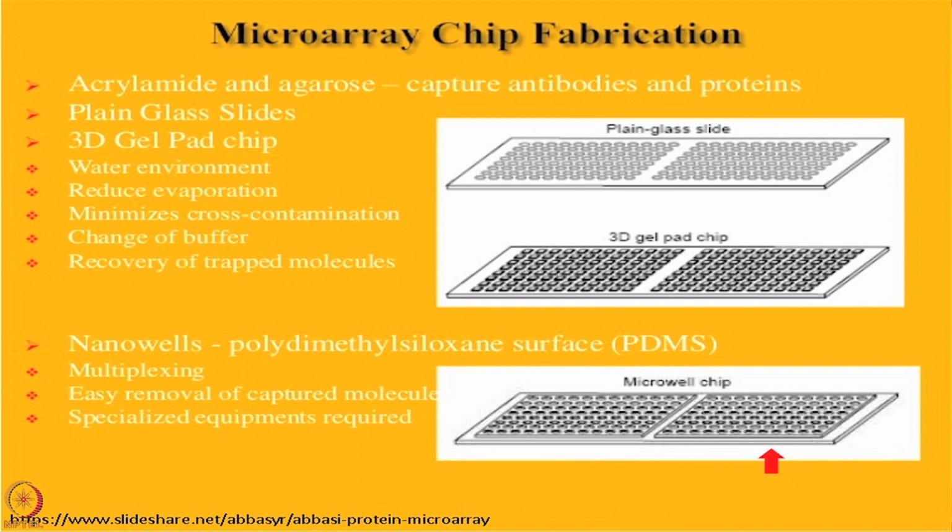This is the micro well. In this well, basically, you can do multiplexing. So this is high definition slides basically. So these are 3 different slide formats we use for making the protein array or peptide array.